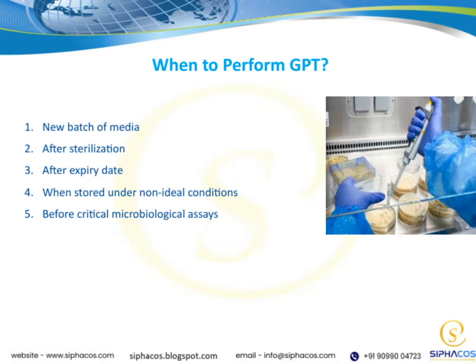Let's take a look at the key moments when it's important to perform GPT. First, whenever you get a new batch of media, it's a good idea to run GPT to ensure its quality and reliability before use. Similarly, after sterilization, performing GPT helps confirm that the sterilization process hasn't compromised the media. It's also crucial to perform GPT after the expiry date to verify that the media still functions as expected.